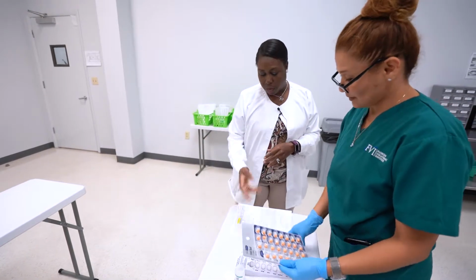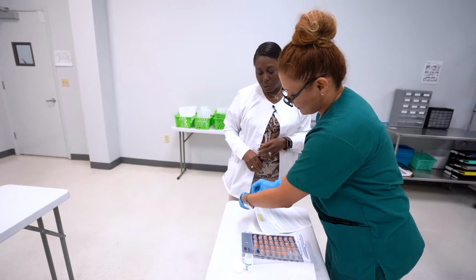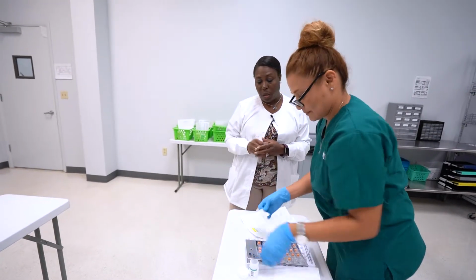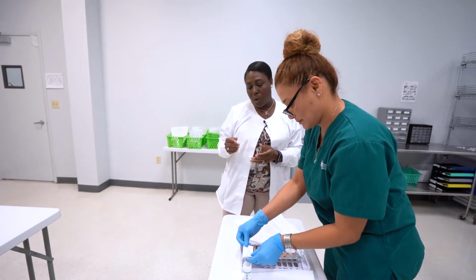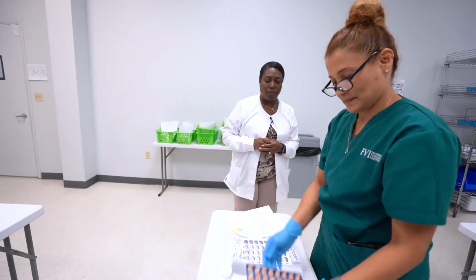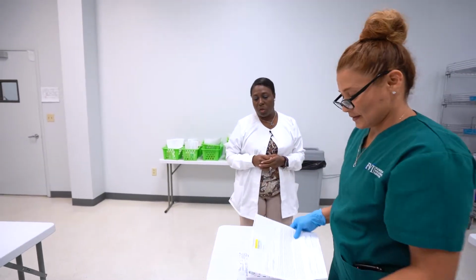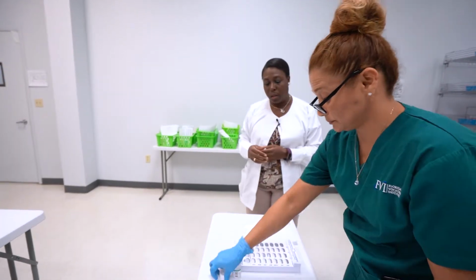And then after that, we want to put the label on the finished product, because we know in pharmacy, everything needs to have a label. We don't want anything to be without a label. So she also will put that in the area to be checked.